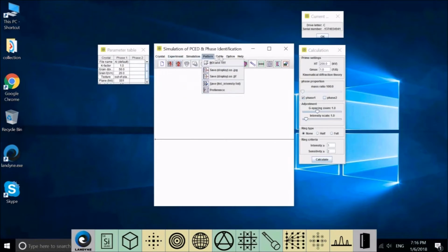The drop-down menu includes all the functions. The graphic menu bar has only a selected part of them, the important ones, which can be used conveniently. The only exception is the drag and drop box, which is only available in the menu bar.